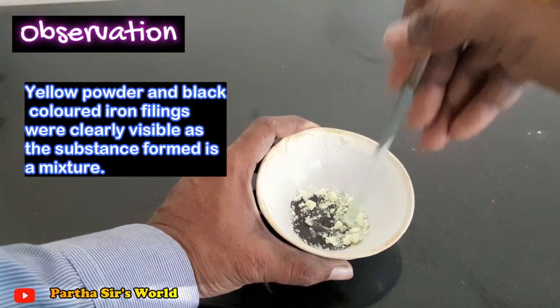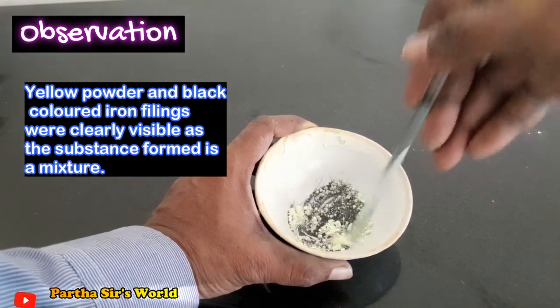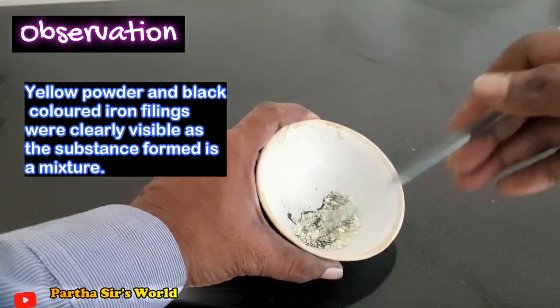Observation: yellow powder and black colored iron filings were clearly visible as the substance formed is a mixture.